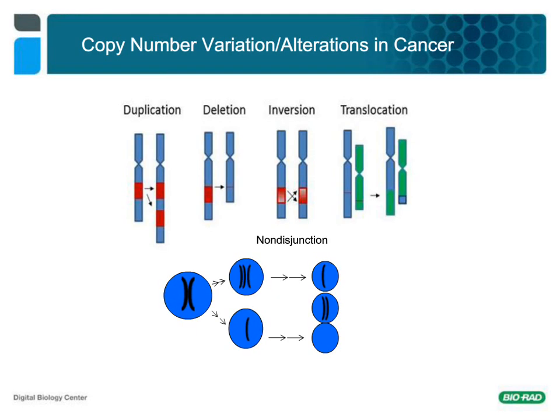So switching gears slightly, we're going to move on to copy number variation or alterations in cancer. This is a bit more of a black box field. It's been known for a really long time, but it's been incredibly hard to measure. Another field that's being very quickly adopted by our users with the advent of whole genome data is the study of copy number alterations or variation.